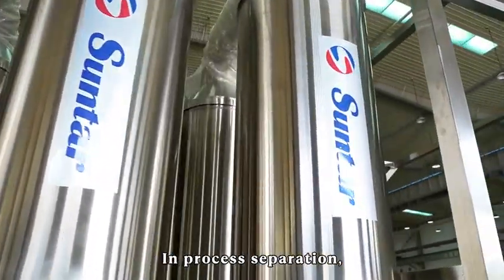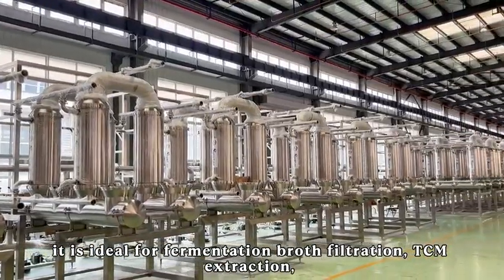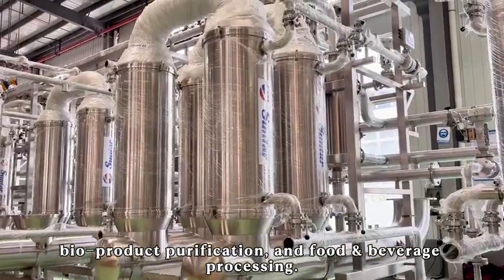In process separation, it is ideal for fermentation broth filtration, TCM extraction, bioproduct purification, and food and beverage processing.